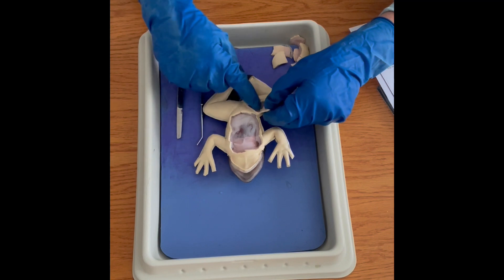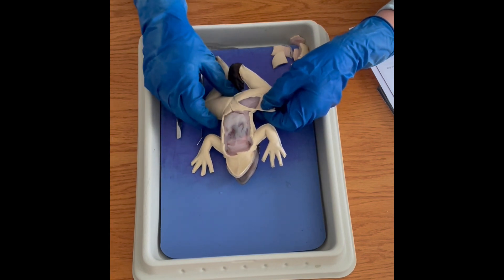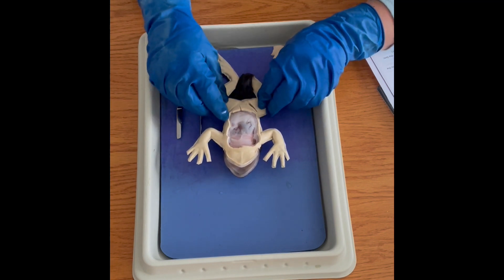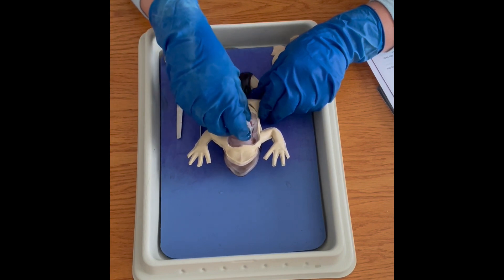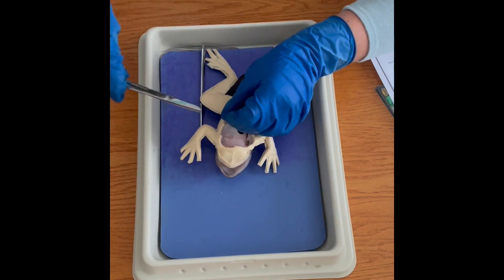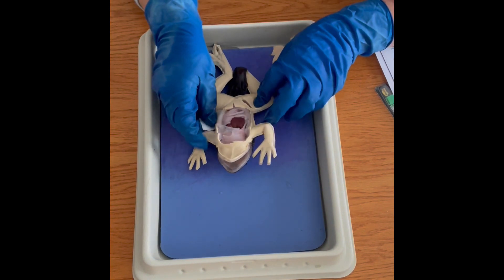I removed some of the skin over the leg and you can see the muscle tissue under there, which is fairly realistic. I would say not quite as easy to identify and see as on a real frog, but close. There is a layer of tissue and muscle laying over the internal organs, which I thought was pretty realistic. Students will have to cut that away — I needed to cut it away from the skin as well, so it is all attached like a real frog.